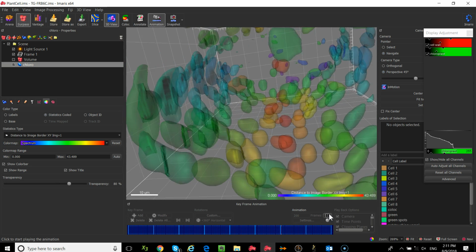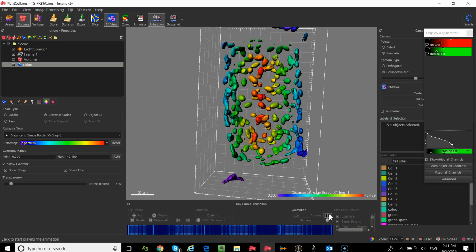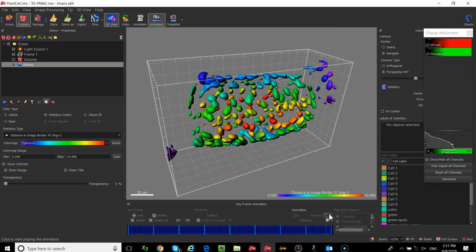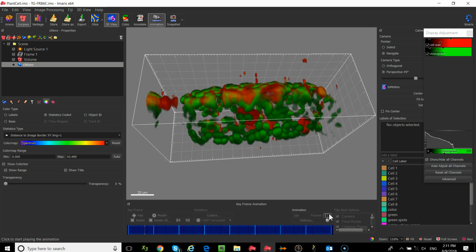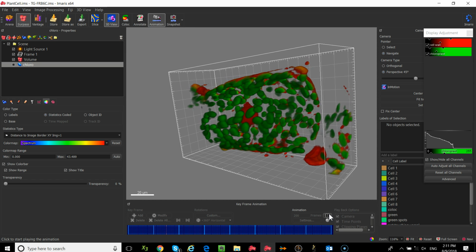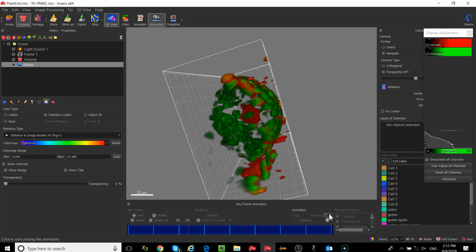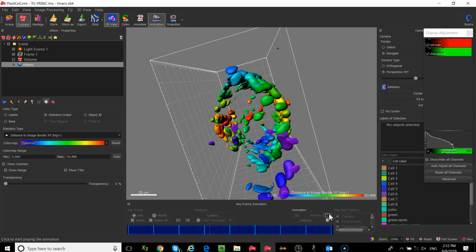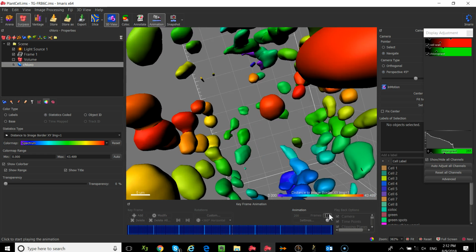But as you add in more keyframes, you're actually making the animation more complex. And so you're probably going to need to have more transition frames, which means you want to increase the number of animation frames. So that instead of transitioning between two keyframes with only a few animation frames, you're basically adding in more transitions, okay? Smoothing out that transition.